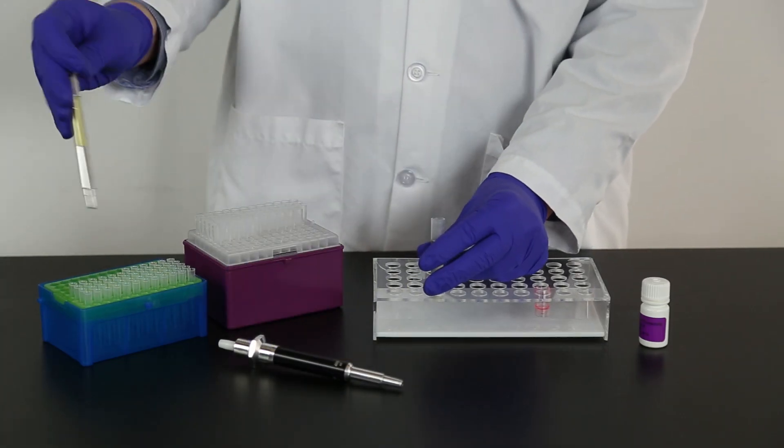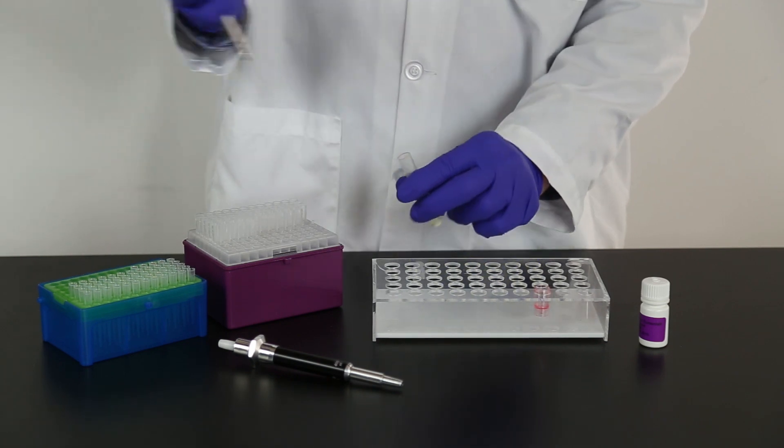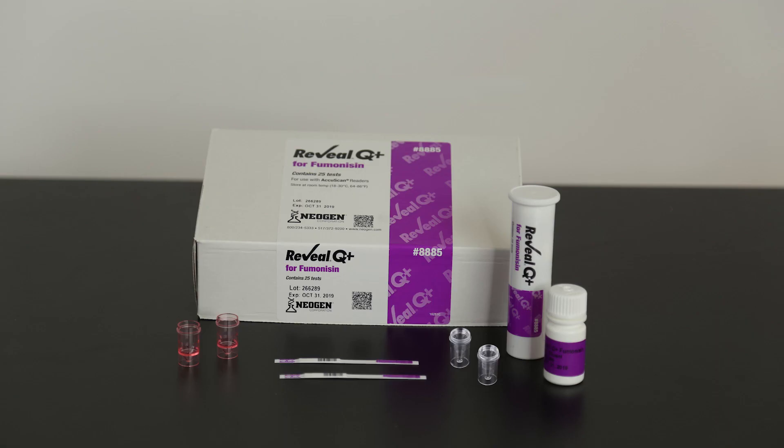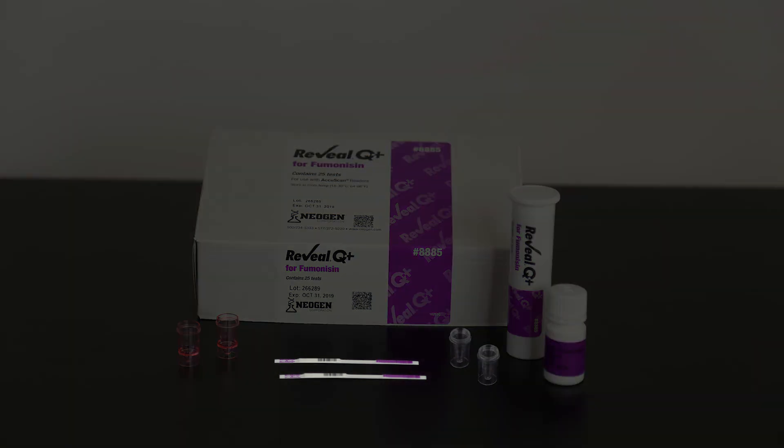Avoid cross-contamination by using clean extraction supplies for each sample. Each kit contains supplies to test 25 samples. The kit includes test strips, clear sample cups, red dilution cups, and a bottle of sample diluent.